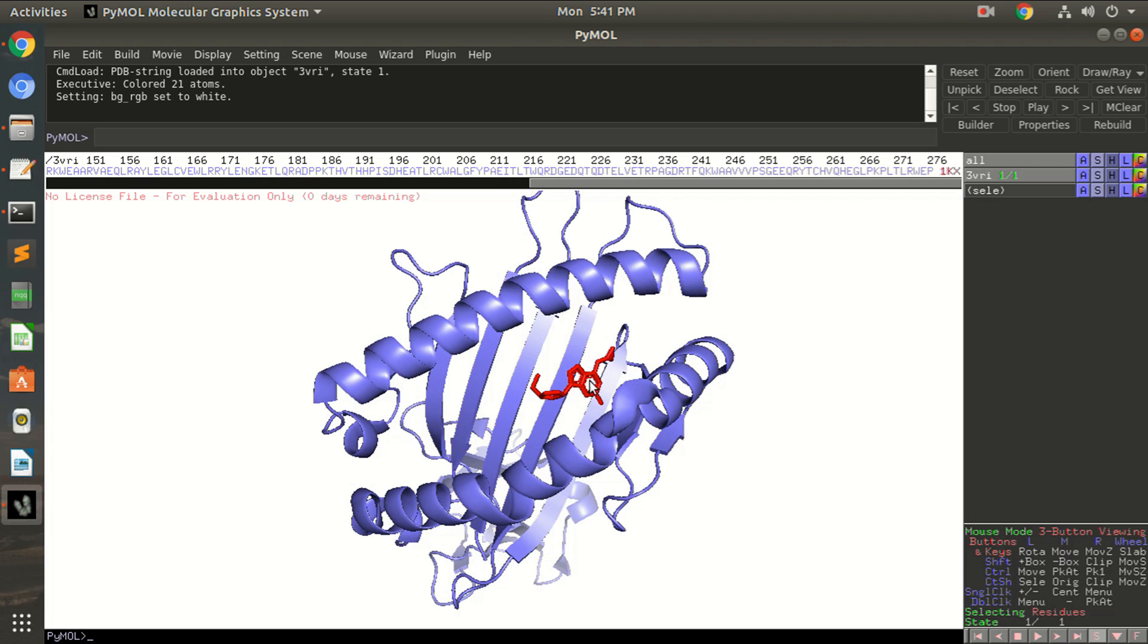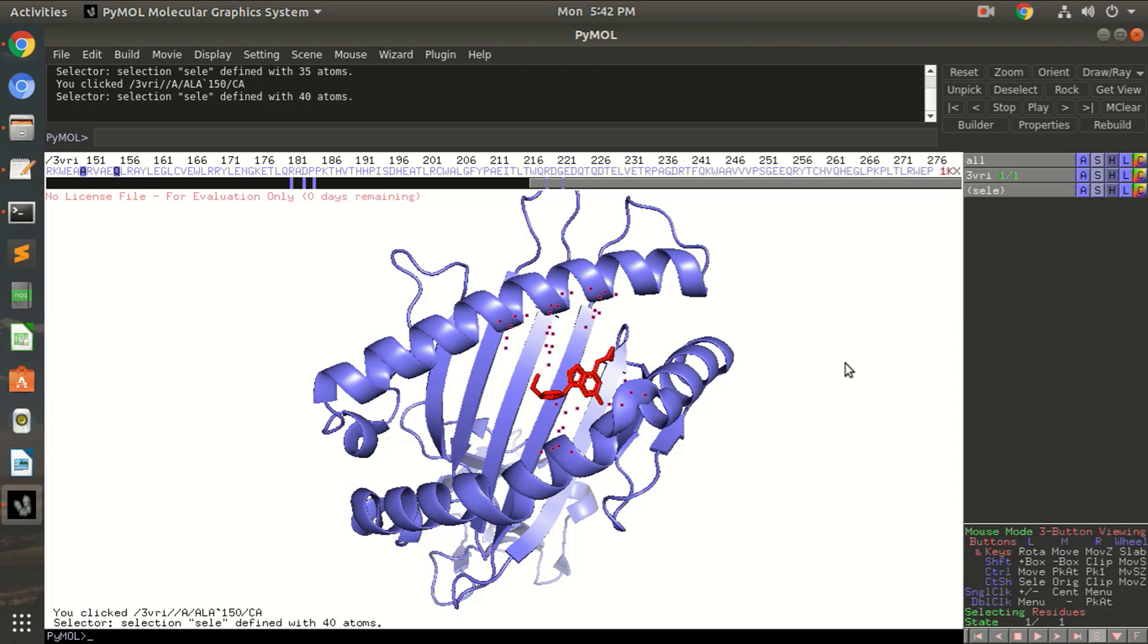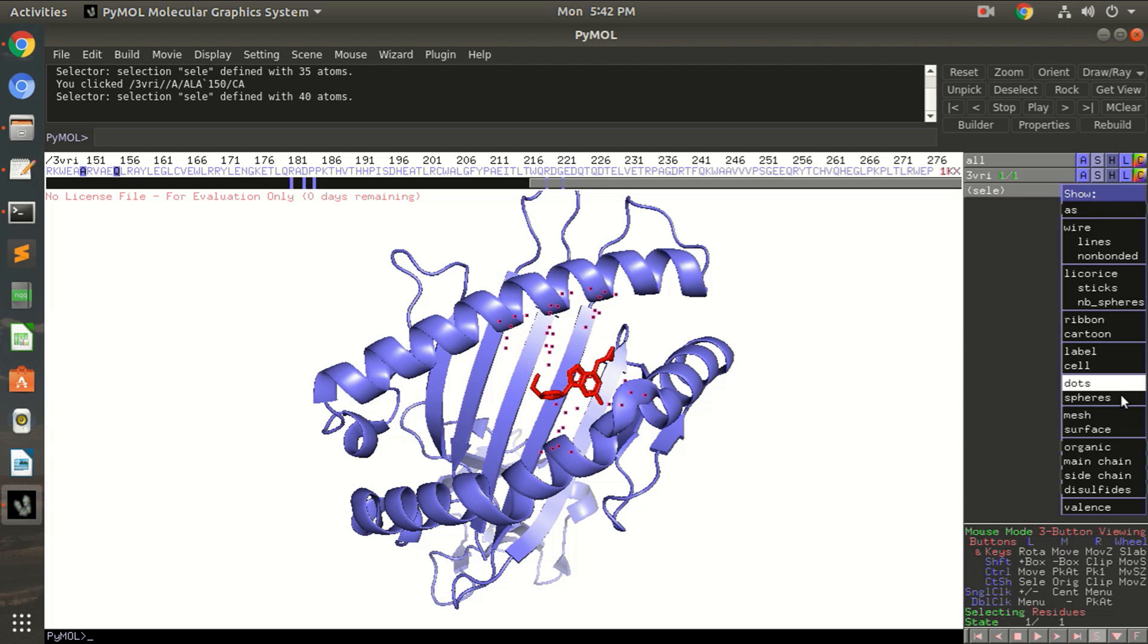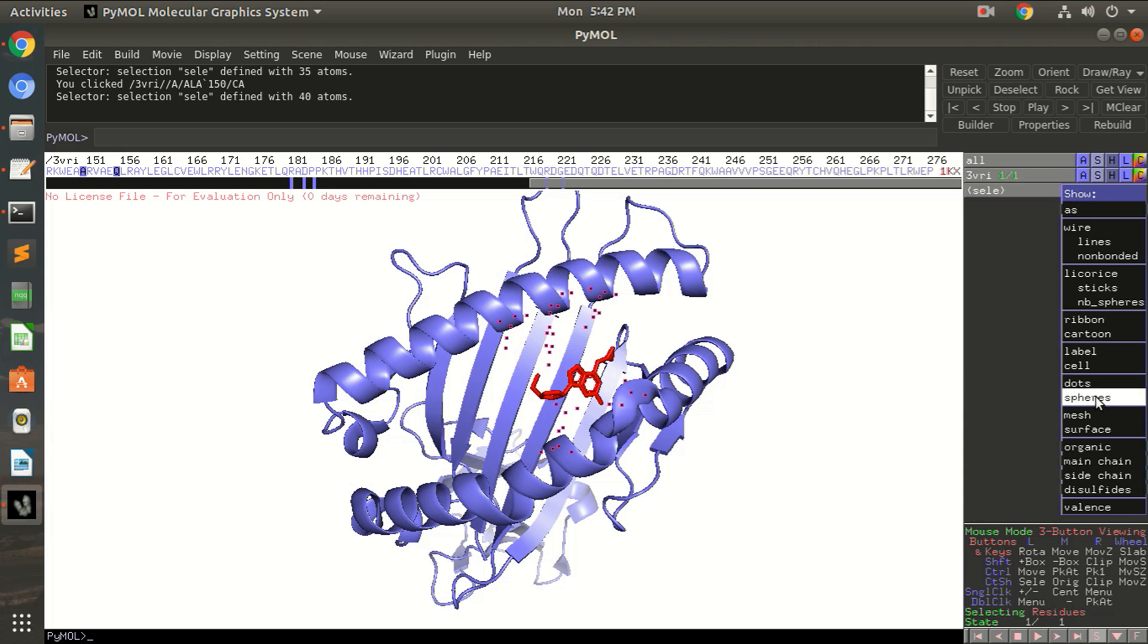So let's start with our pose where you can see the protein and the ligand. Now if you want to visualize the binding residues as sticks, you already know that I assume. Let's select some random residues here nearby this ligand, and if you want to show them as sticks, just go to the right panel, click on selected row and click on S column.